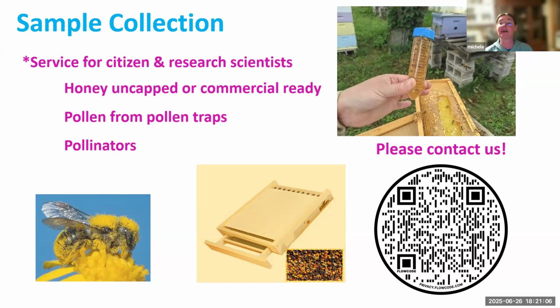Pollen from pollen traps. If any of you have a pollen trap and want to submit a pollen sample, and you have that ability, I strongly recommend that. I'll get into why a little bit later on. And then again, like you saw in my previous slides, I'll also take pollinators, hopefully very, very carefully.